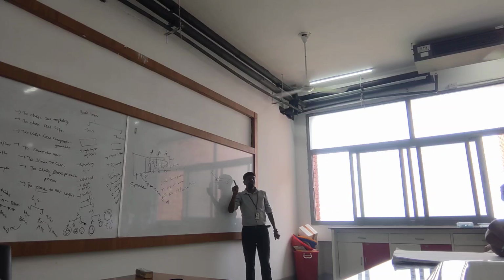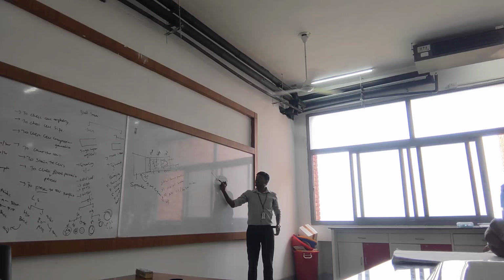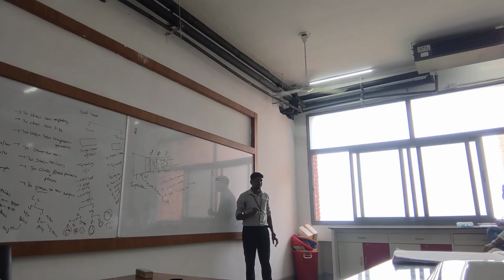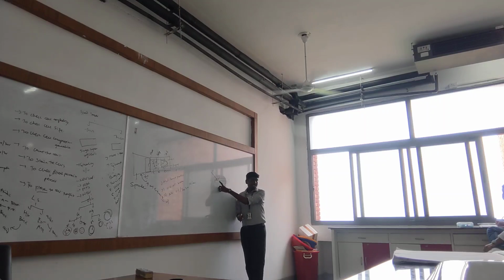Ensure that the spreader doesn't have any nicks and chips. What do I mean by nicks and chips? The edge should not be rough. It should be an even edge. The spreader edge should be smooth and even. It should not have any rough edges. Clear?